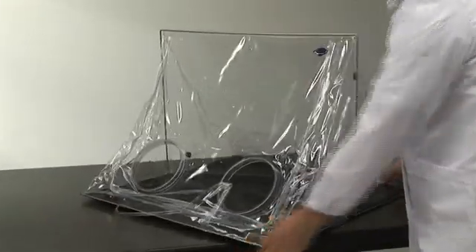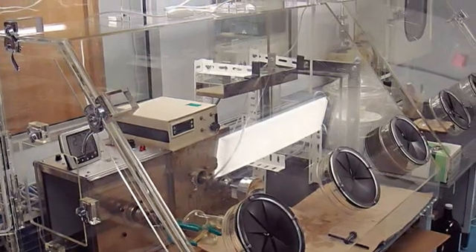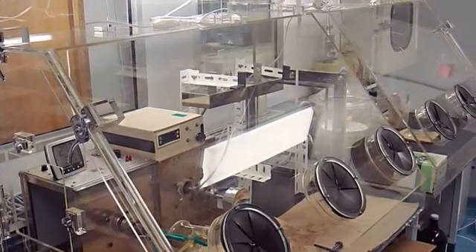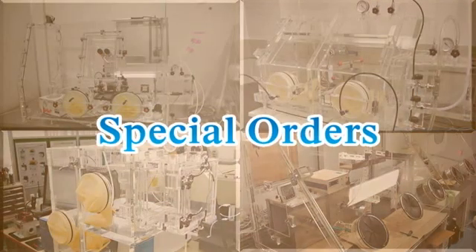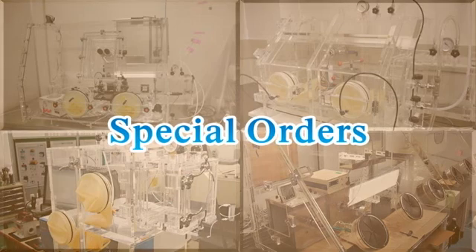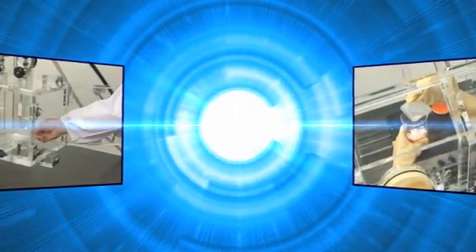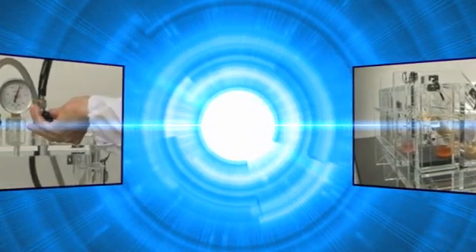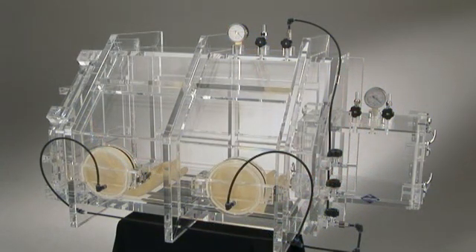We have multiple types, including one which can be folded. We can make gloveboxes according to your ordering size and parts. Feel free to email us from our website. Made from clear acrylic and has good sealing and nice visibility. The Sanplagic vacuum glovebox supports the research and development of the next generation.